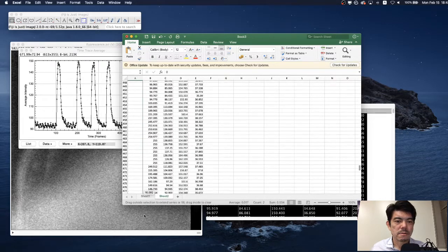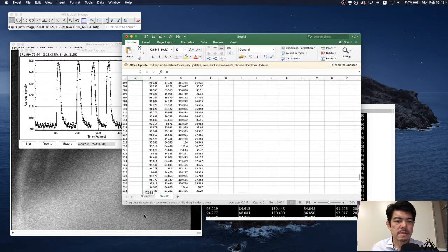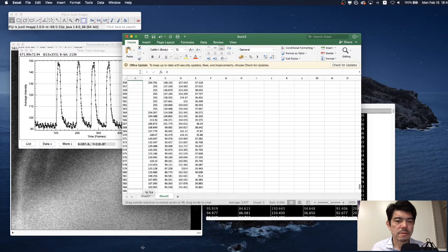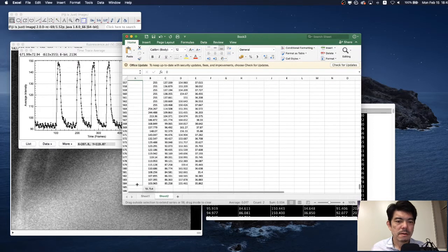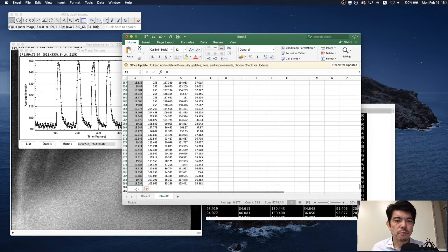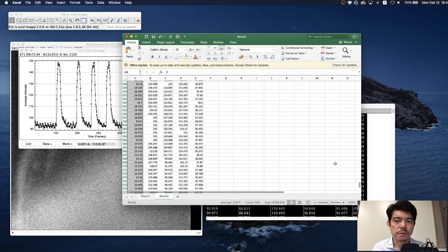It has about 580 frames, so it was 20 seconds recording.